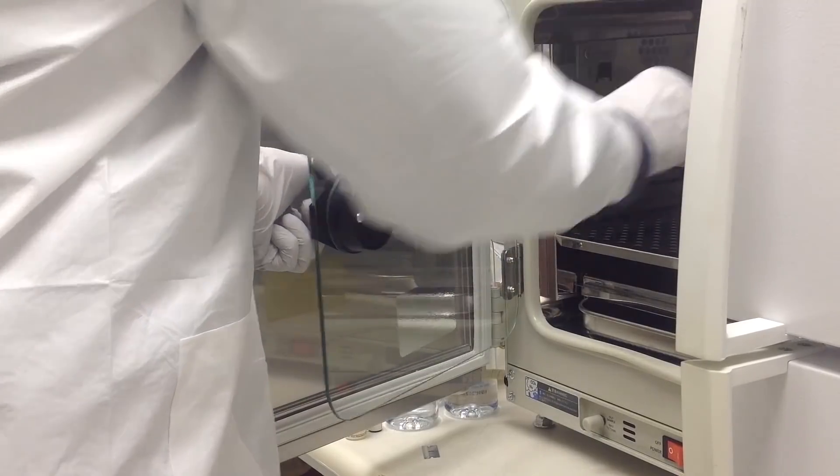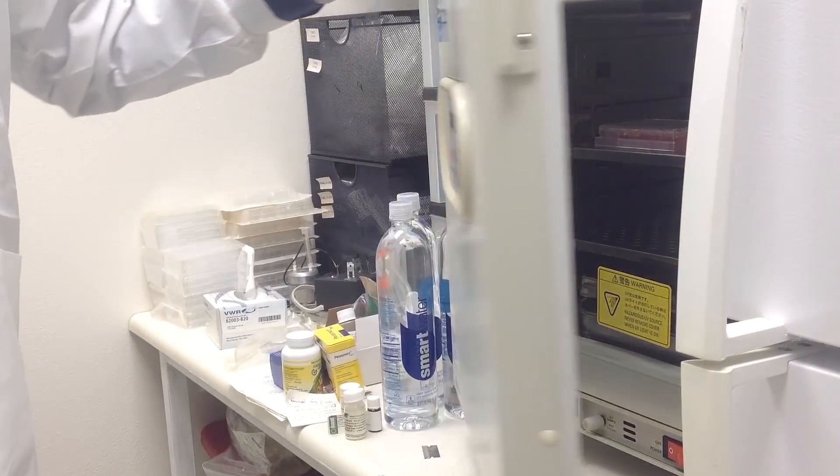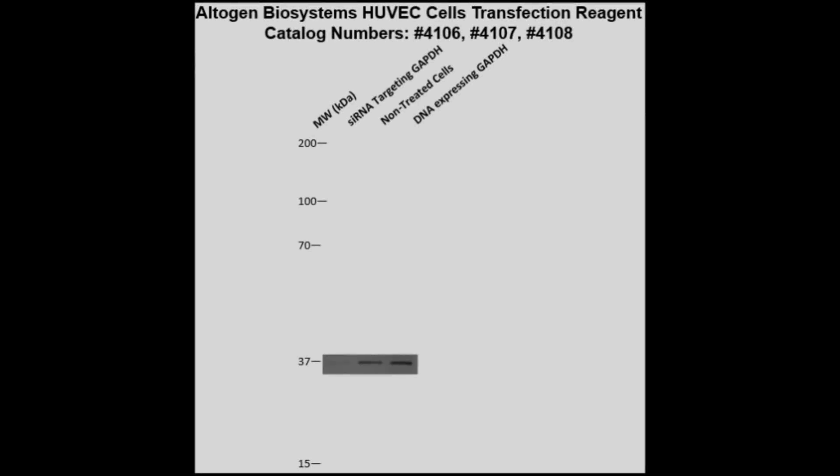Assay for phenotype or target gene expression 48-72 hours post-transfection. Here is a Western blot validation of our transfection reagents. HUVEC cells were transfected with either GAPDH DNA, which resulted in overexpression as compared to non-treated cells, or GAPDH siRNA, which resulted in partial silencing.